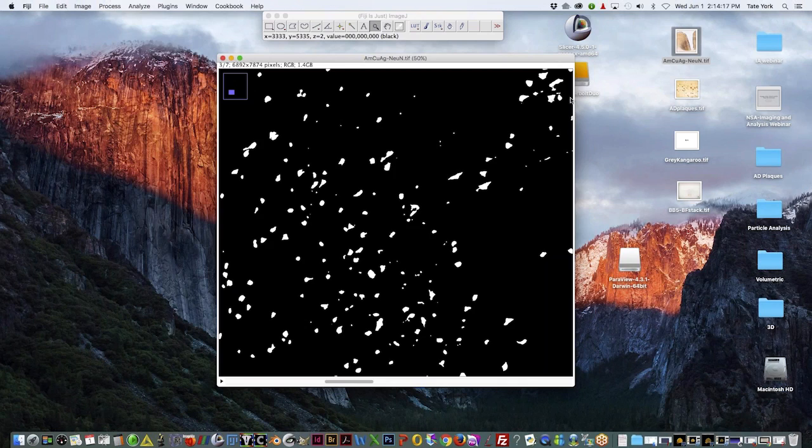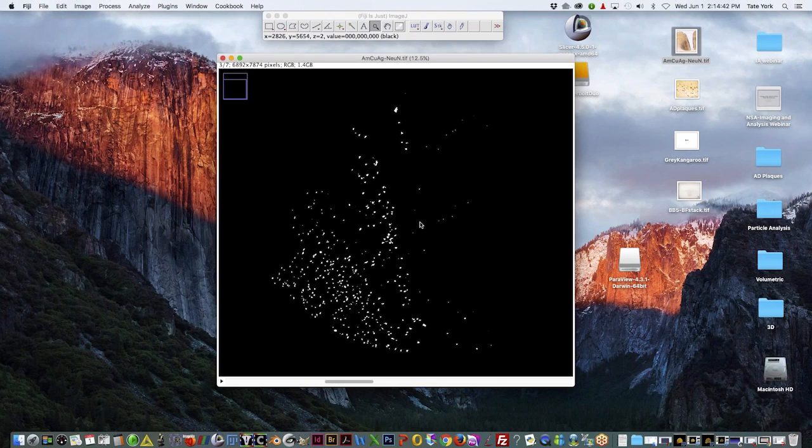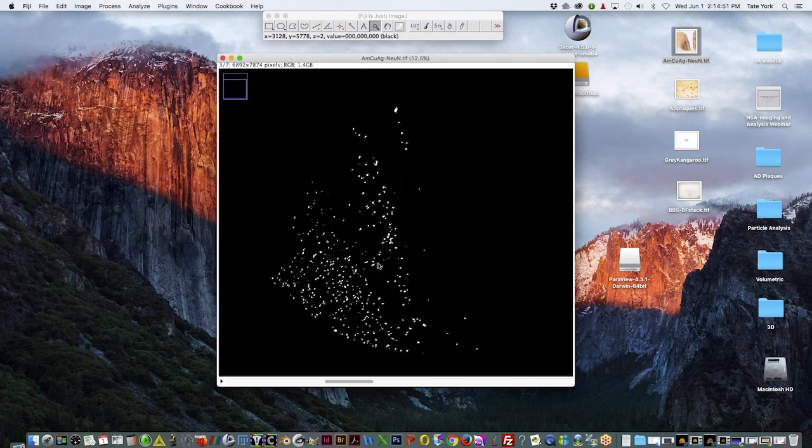So what we can do with this binary image is run a particle analysis. And this is another tool offered in Fiji, and you can change the parameters, whether it's by particle size or circularity of the object. And so what we can do for better visualization is create an overlay over these degenerating neurons compared to the NeuN positive neurons here.